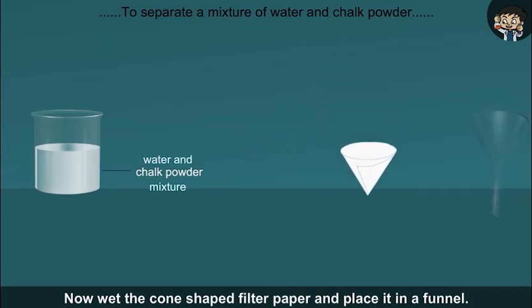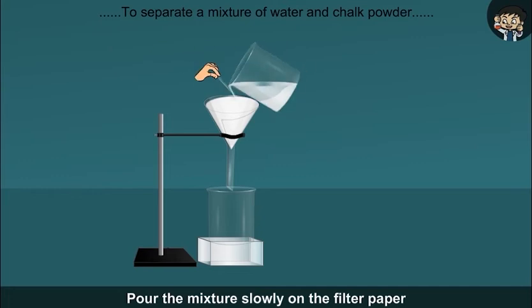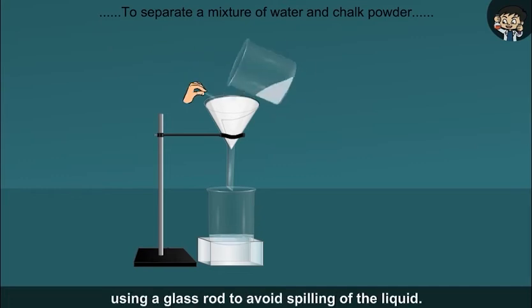Wet the cone-shaped filter paper and place it in a funnel. Pour the mixture slowly on the filter paper using a glass rod to avoid spilling of the liquid.